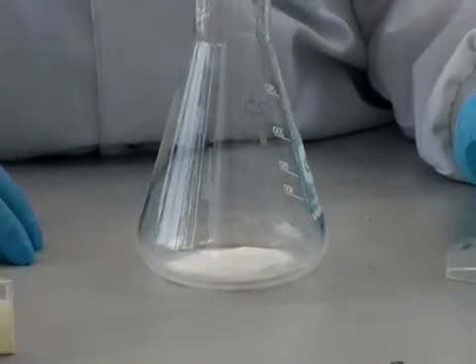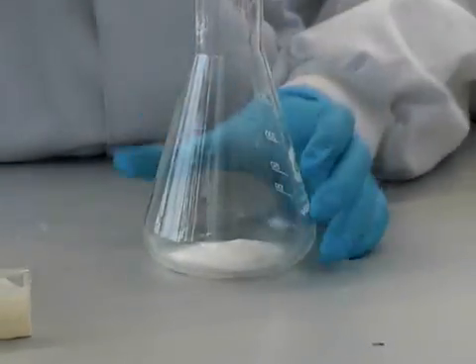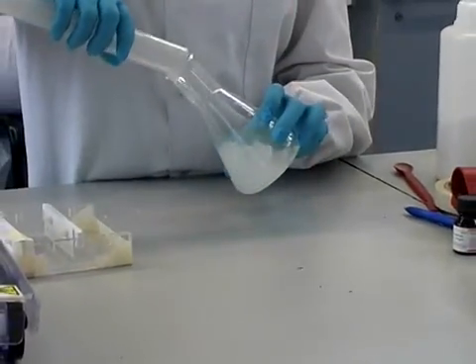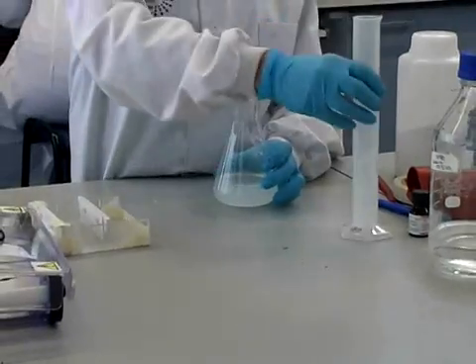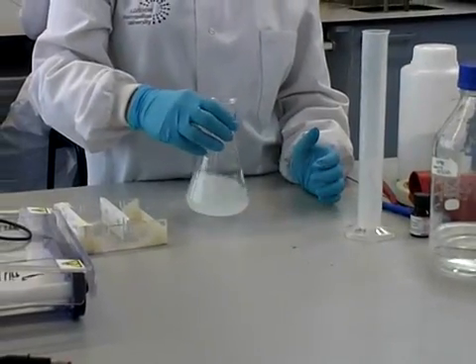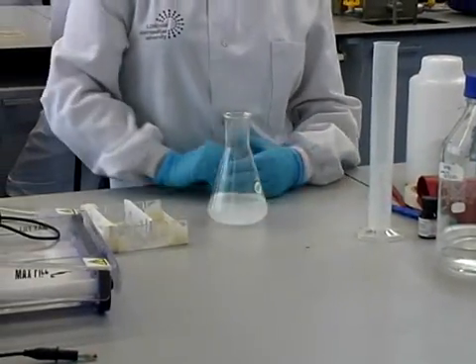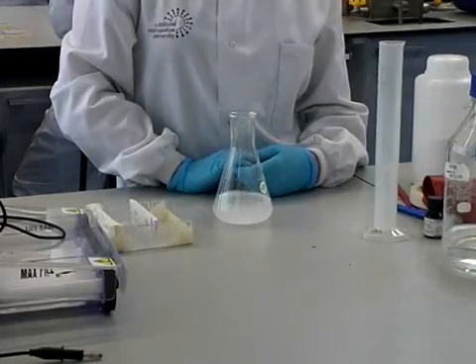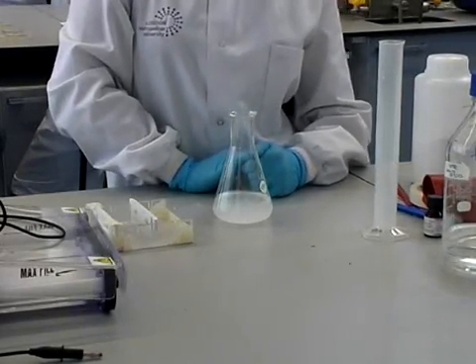One gram of agarose gel has been weighed into the conical flask and to this is added the 100ml of Tris-Borate EDTA. This is mixed and the solution will be heated to dissolve and melt the agarose, then it will be poured into the gel former.